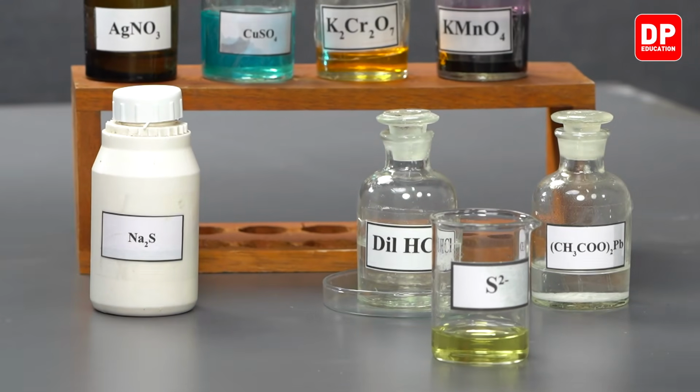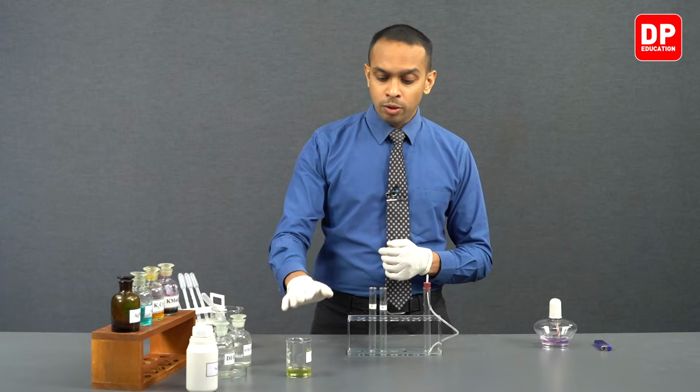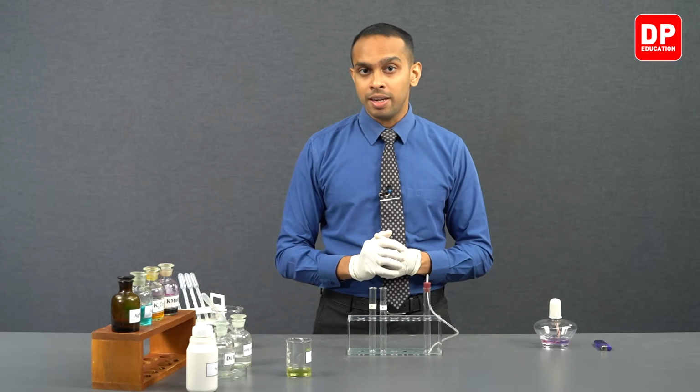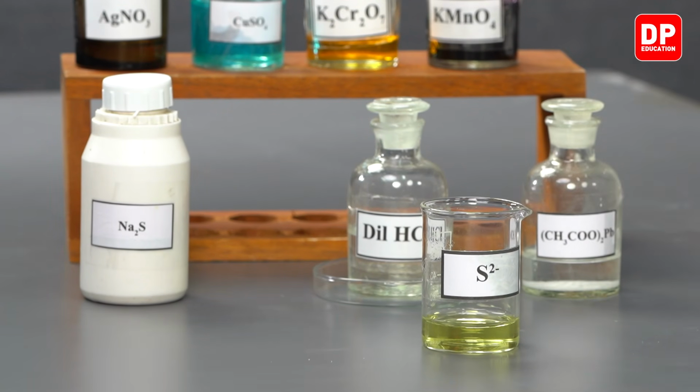So we have taken sodium sulfide solid and dissolved it in distilled water. And now we are going to take the sodium sulfide aqueous solution that we have in front of us here and react it with copper sulfate and silver nitrate.